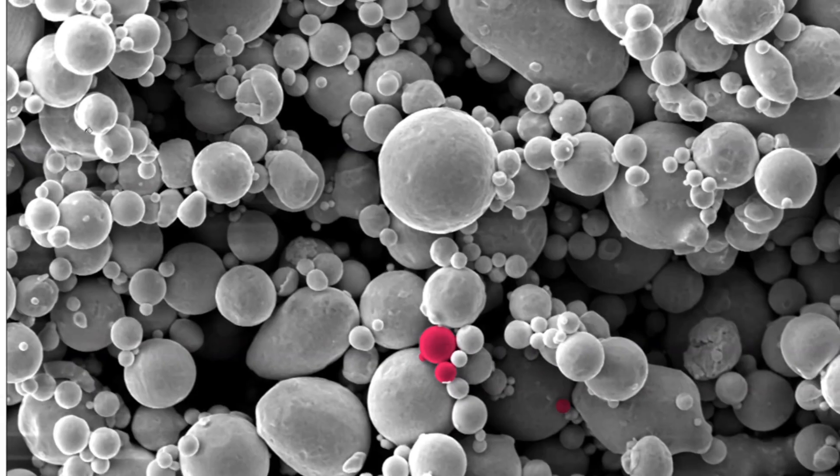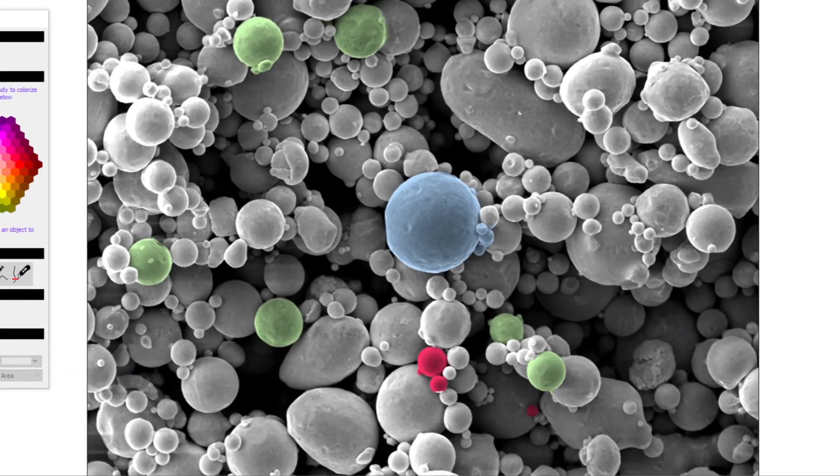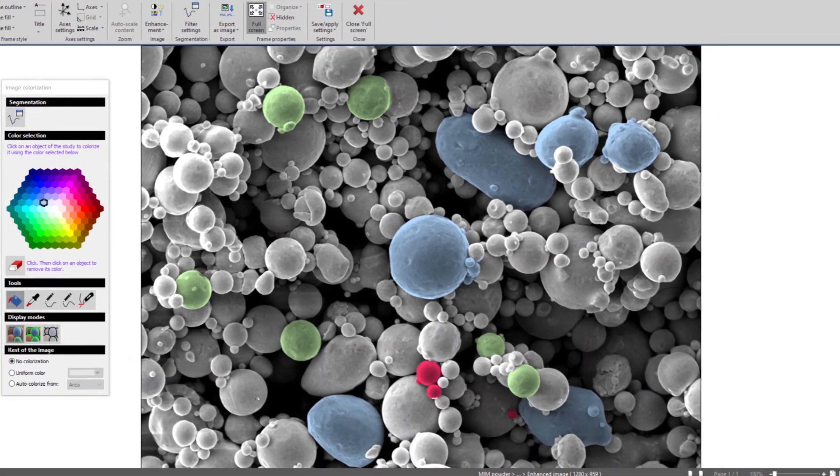And there you have it. In under a minute, my SEM image is colorized and ready for publication.